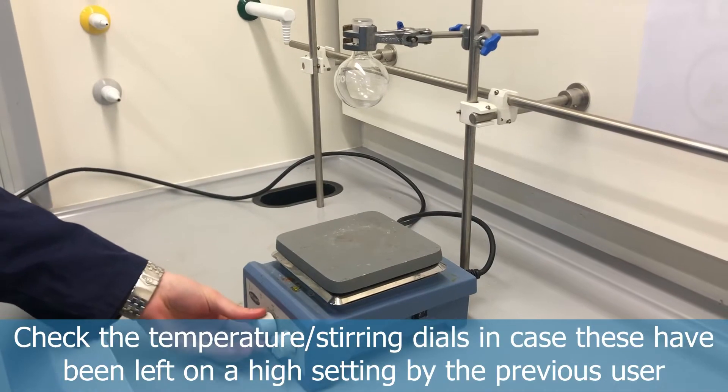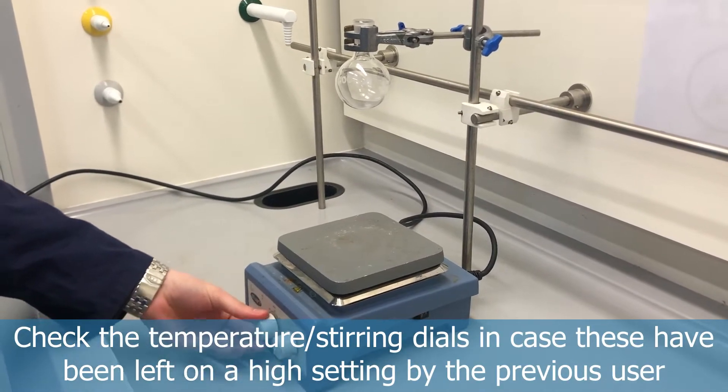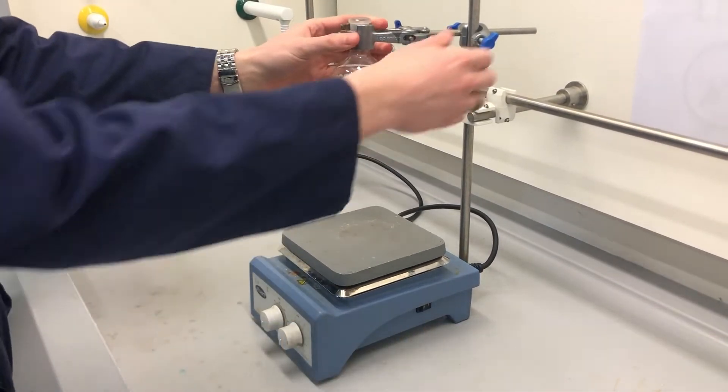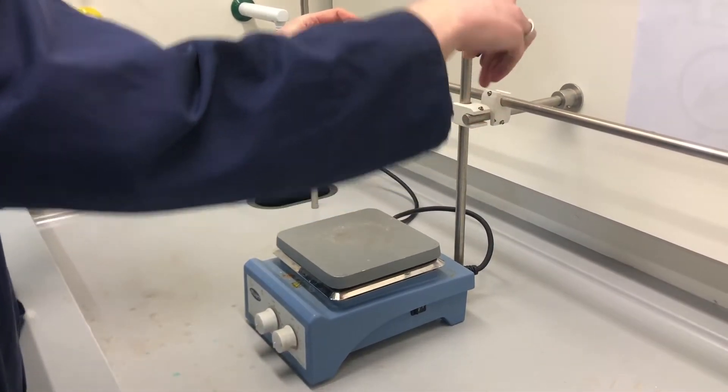Once it's plugged in and switched on, it's always good practice to check the temperature and stirring dials, as these may have been left on by a previous user and you don't want it to be inadvertently heating.